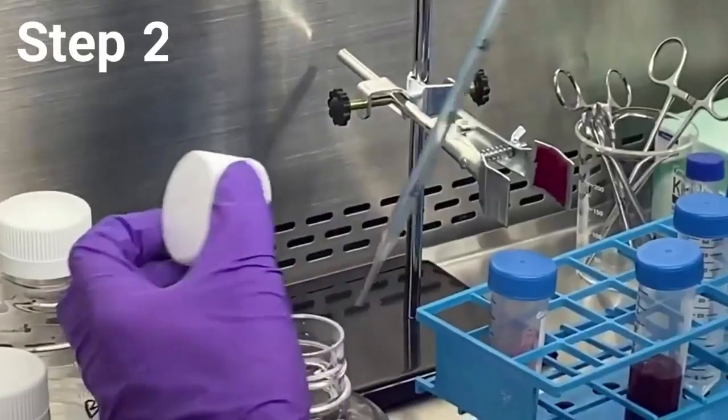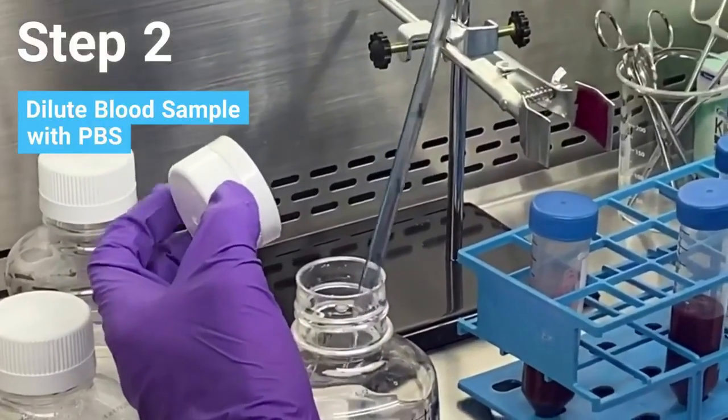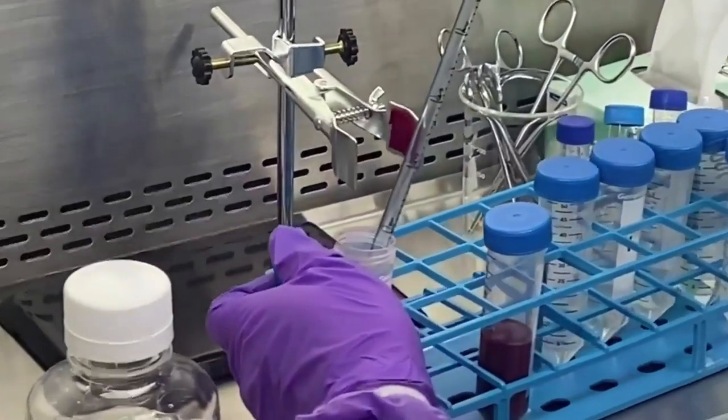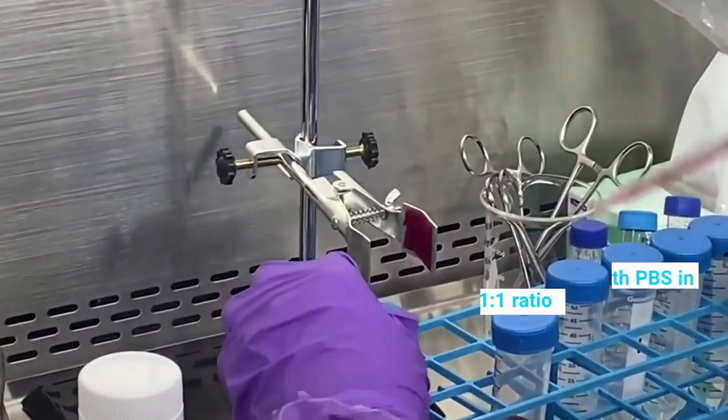Now you're ready to begin your isolation protocol. Start by diluting your blood sample with an equal volume of phosphate buffered saline, or PBS, and gently mix. This dilution procedure will help minimize granulocyte contamination and increase cell viability.